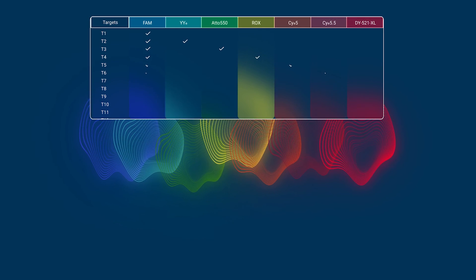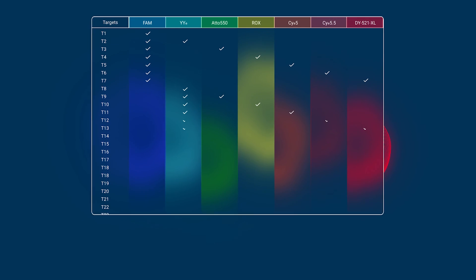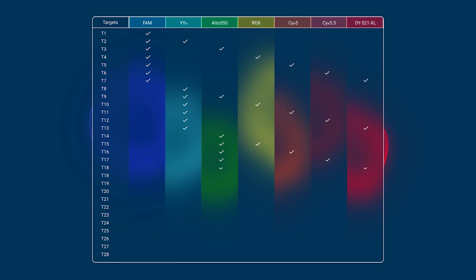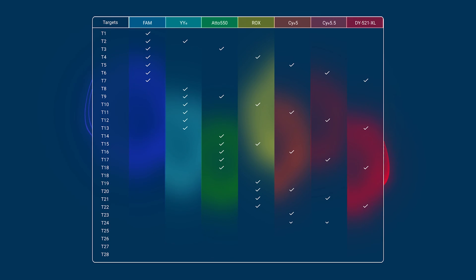And it doesn't stop there. Using higher order multiplexing, you can combine colors to detect well over 20 targets in a single chamber.